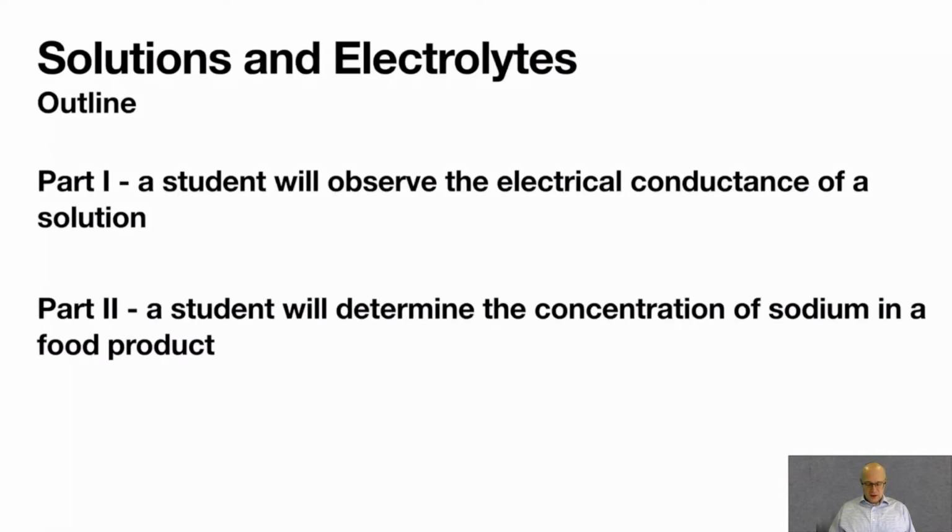Part 1. A student will observe the electrical conductance of a solution. Did you know that if you dissolve electrolytes in solution, the solution becomes conductive? It can conduct electricity. We'll experiment with that.